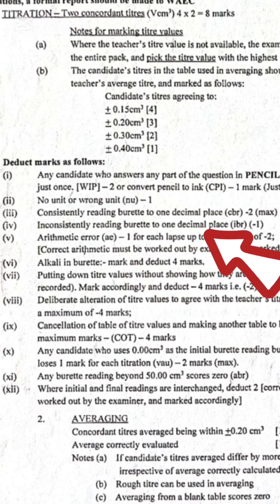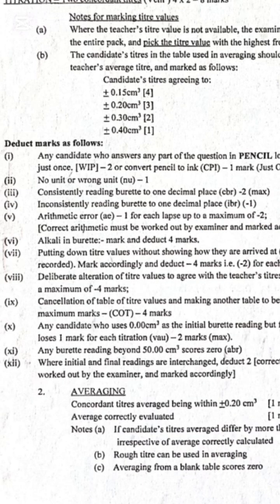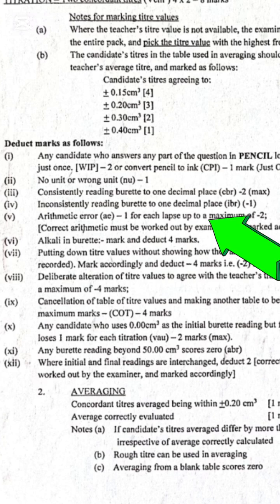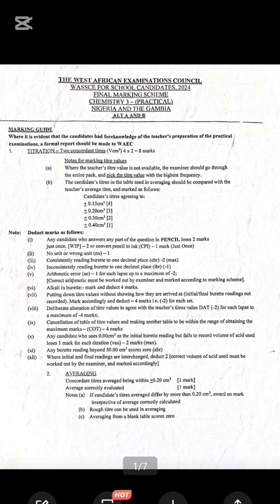Number four: inconsistently reading the burette to one decimal place — that's minus one. Number five: arithmetic error — that's minus one for each, up to a maximum of minus two. If you add minus two to what we already have, you can see the running total.